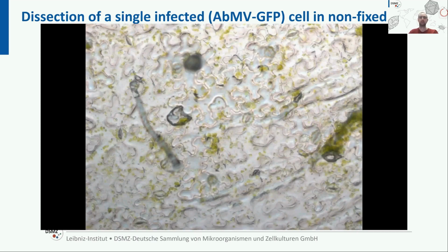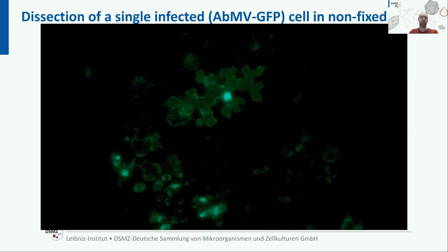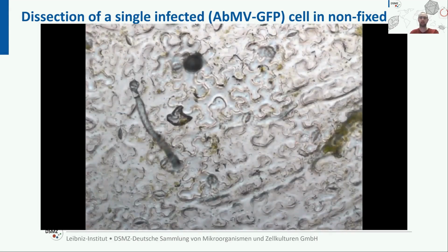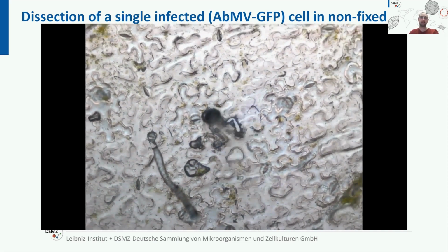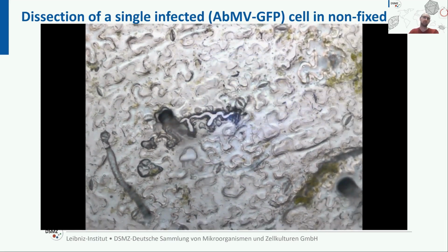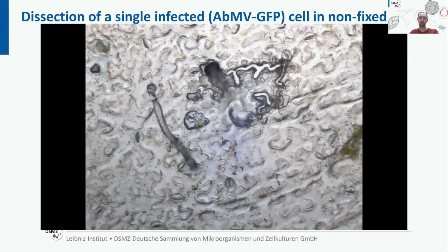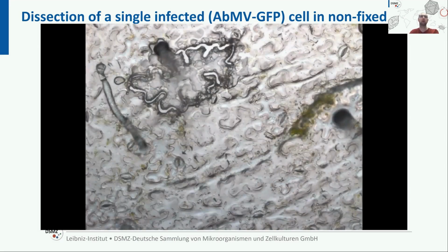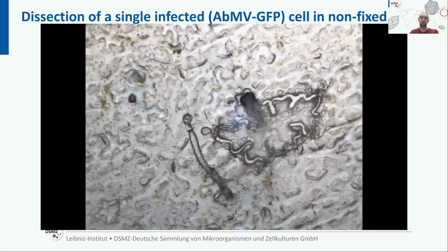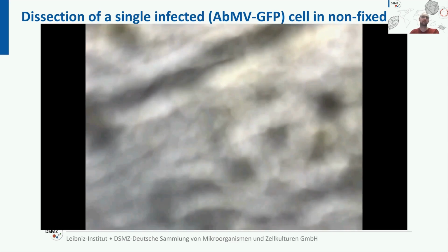In the next step, as you can see here, we are going to dissect the cell. Of course, this is another example as shown previously. So the cell is another than previously marked, but the selection process is identical. The laser cuts out exactly the cell we wanted to investigate. Sometimes, as you can see in a second, it has to cut twice. This is because the tissue is maybe thicker in one point or another, or it's just not completely in focus, but you can adjust the parameters of the cutting to ensure the successful sampling.